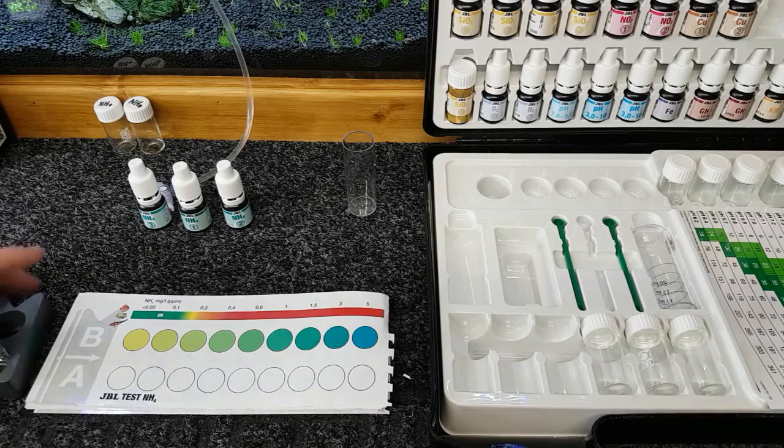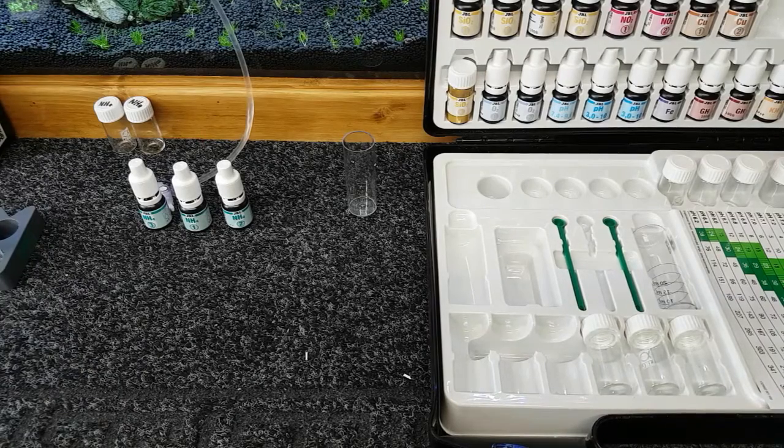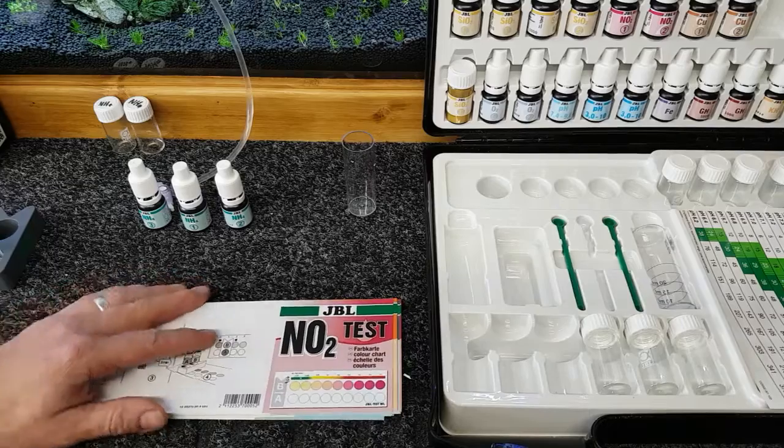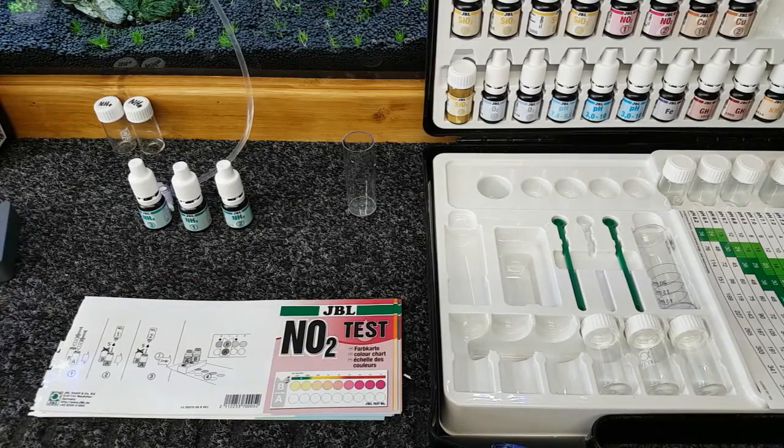Right, now what we're going to test for is nitrite, which is NO2. Just write that on here. NO2 on the top of there.